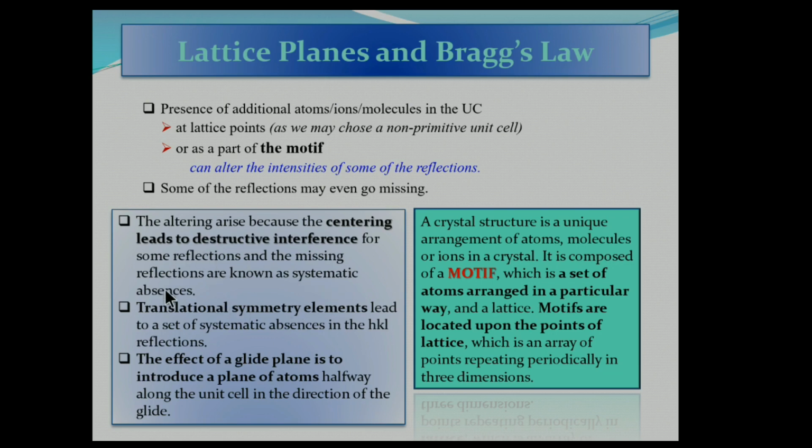And again, one more factor which is affecting the pattern is translational symmetry elements. So symmetry elements of a crystal also cause these destructive interferences. And again, the effect of glide planes, crystal defects or glide planes are also responsible for this missing reflections or systematic absences.